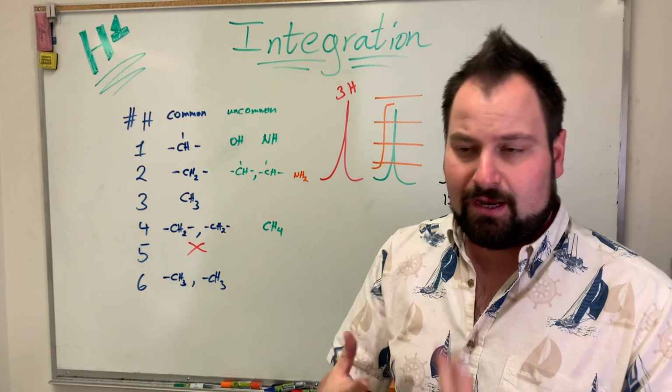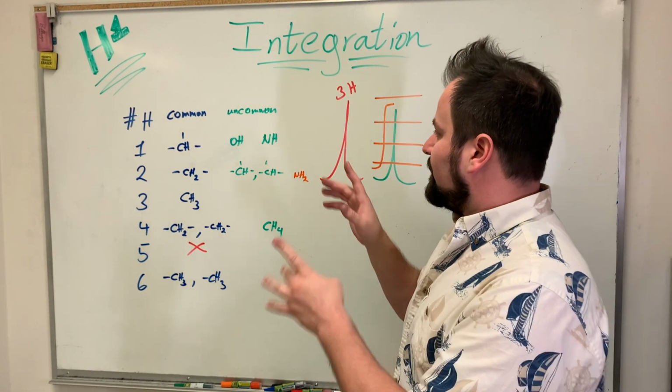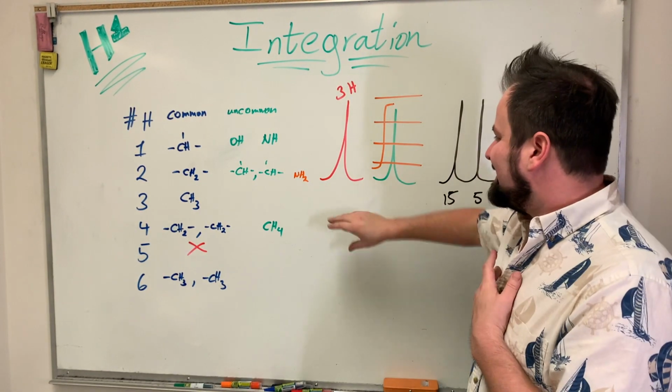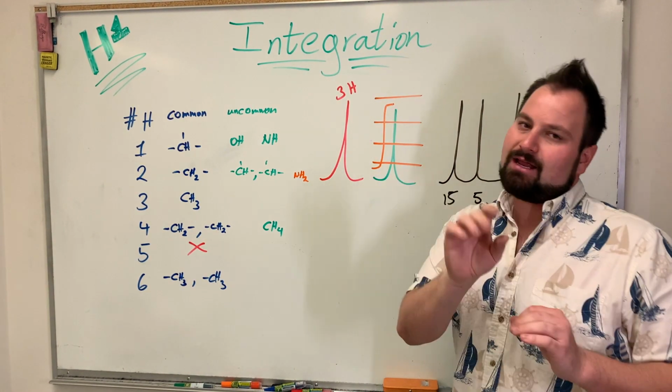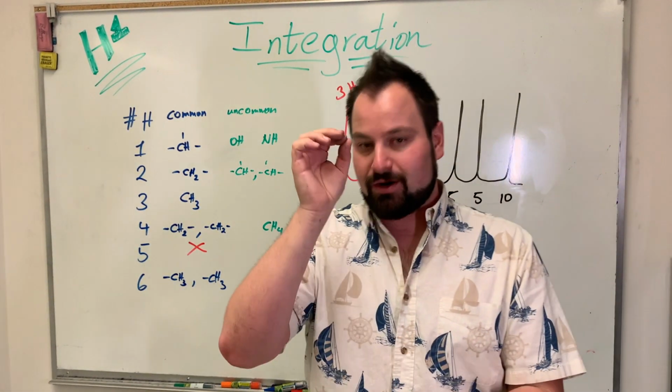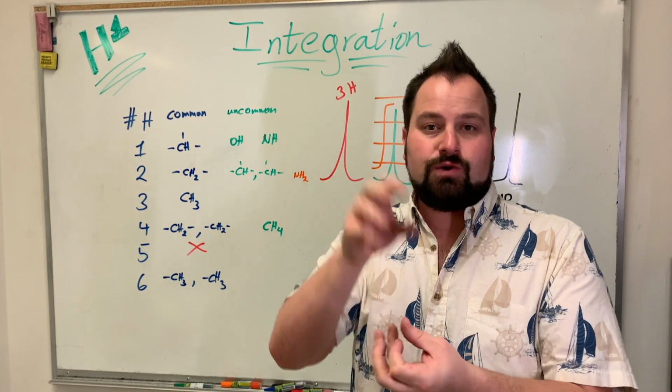Okay, now getting into the more useful stuff, our next topic is integration. Essentially, it's the area underneath a curve, and it tells you exactly how many hydrogens are on the carbon, or whatever element, that you are interested in.